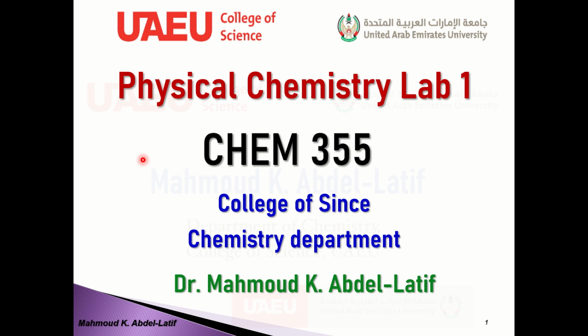I am Mahmoud Abdel-Latif and inshallah I will be your instructor for this physical chemistry lab, which is given under the College of Science, Chemistry Department, United Arab Emirates University.